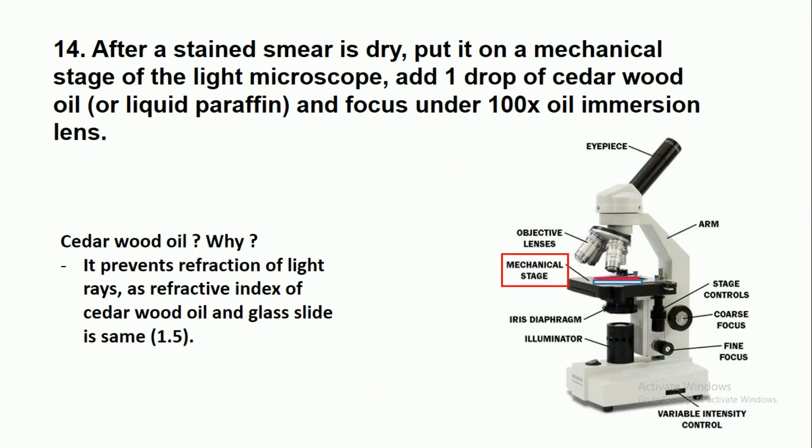After the stained smear is dry, place it on the mechanical stage of a light microscope. Add one drop of cedar wood oil or liquid paraffin and focus under the 100x oil immersion lens. Cedar wood oil is used because it prevents refraction of light rays, as the refractive index of cedar wood oil and the glass slide is the same — approximately 1.5.